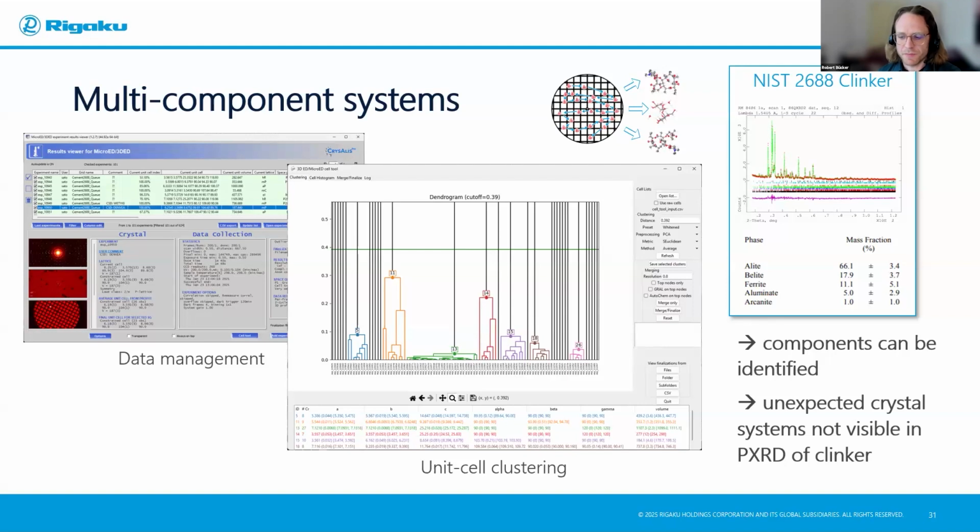For example, if you load them by touching your powder with the grid and rely on electrostatic attraction, do it a bit tilted and you get a gradient. That's one way. If you do it with drop casting, do it with multiple drops and blotting runs and so on.